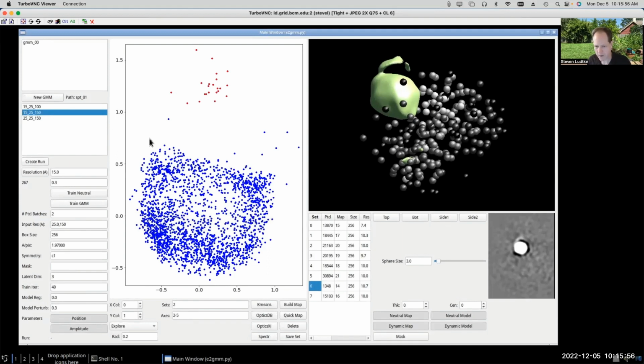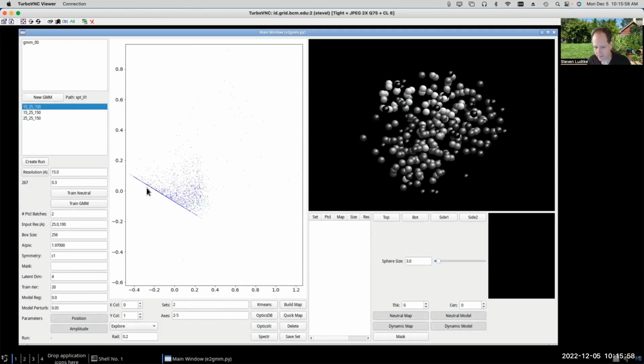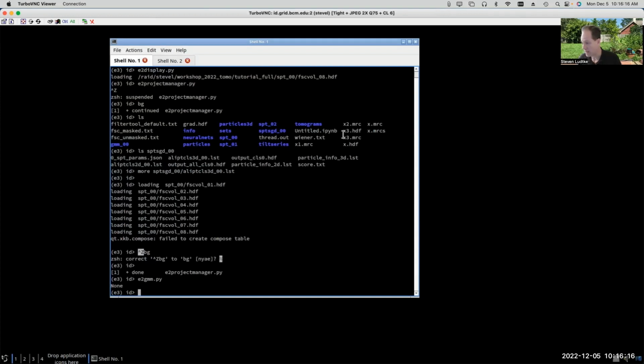Just beware if you try and run on your own data and you see stuff like this. If you can't figure out how to solve the problem, you can always send me an email, and I can try and help you out before next week. Next week we'll talk through all of the different steps in this process. Okay. Any questions about any of that?